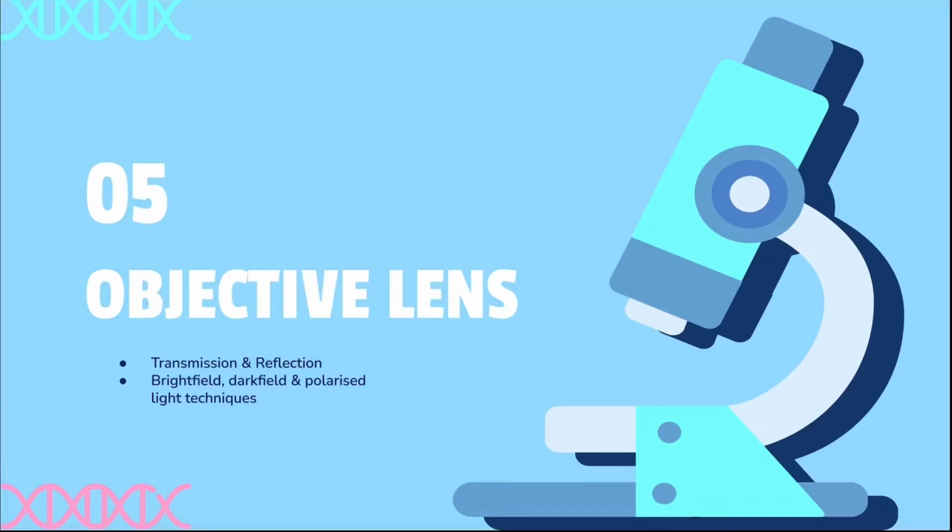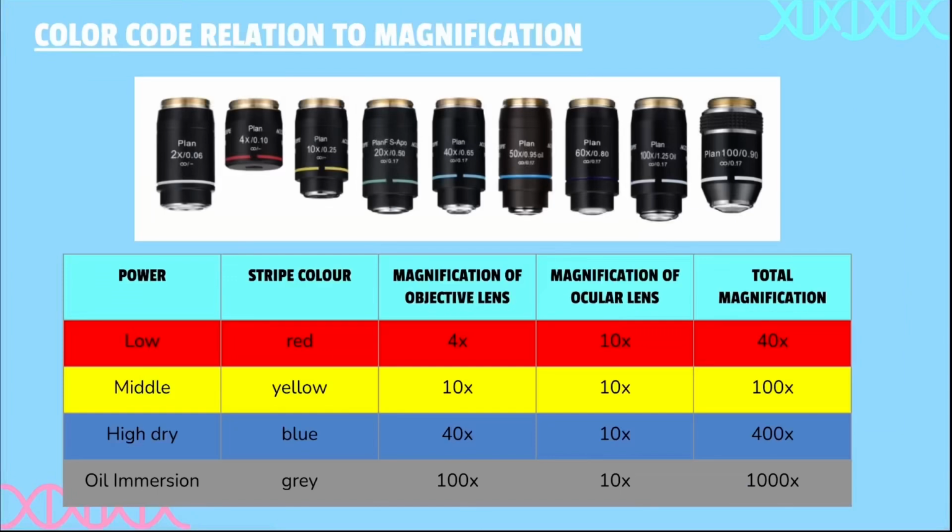So, as material science students, we've been using microscopes to identify material characteristics and grain structure. But are you aware of the color codes on each of the objective lenses? An international color code has been devised to make it easy to identify the magnification of an objective lens.